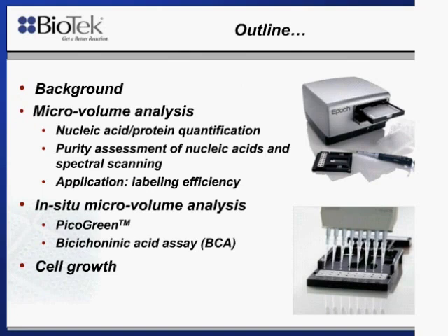And then we'll move on to look at some in situ microvolume assays. This will allow the ability to extend the dynamic range of quantification in microvolume. And we'll discuss the PicoGreen assay as well as BCA assay for protein analysis. And then I'll round out the talk with a discussion on microvolume analysis of cell growth.